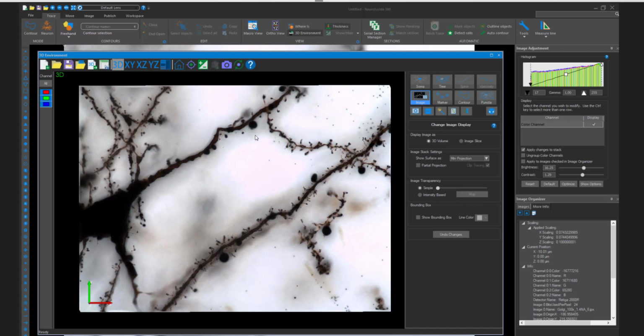Back to the optimization of these Golgi stained images. One question comes in about deconvolution, and there was an old deconvolution module with Neurolucida 360 through Huygens. I believe that is no longer applicable, and it may be grandfathered in for some users. But at this point, I don't think we support that any longer. So if I'm incorrect, my apologies.